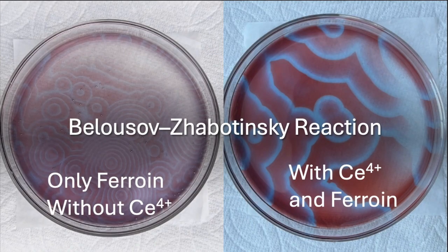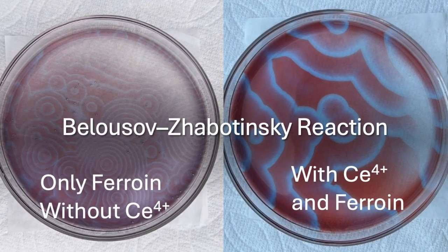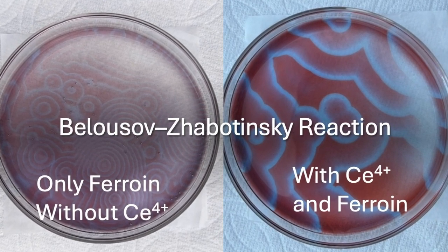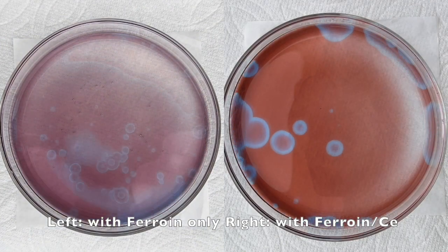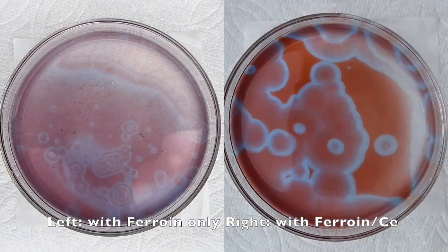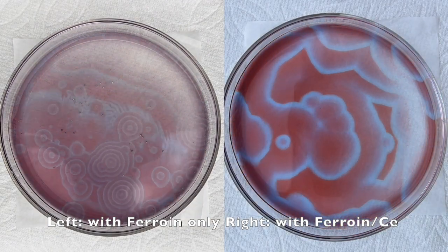In the previous two episodes, we explored the only ferroin-catalyzed BZ reaction and the variation of the BZ reaction involving both cerium-4 ions and ferroin. In this episode, we will discuss the BZ reaction without ferroin. But before we move on, here is a side-by-side comparison between the two variations of the BZ reaction.